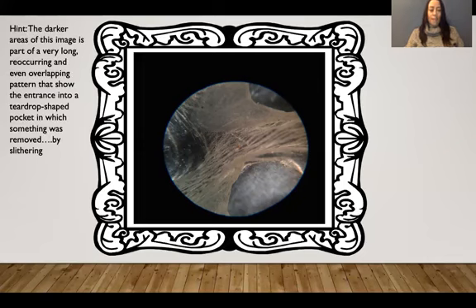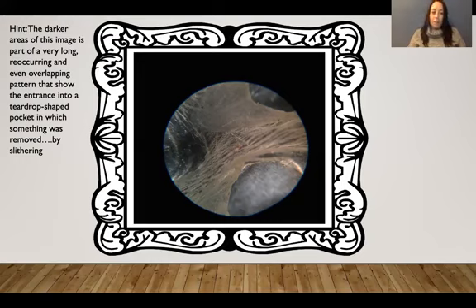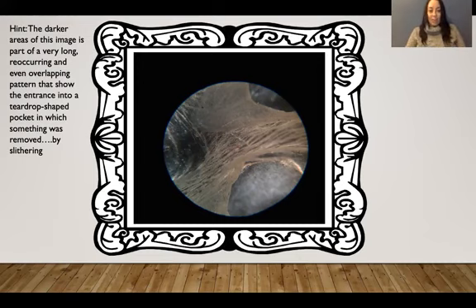Okay, and there is your hint. The darker areas of this image are part of a very long, reoccurring, and even overlapping pattern that shows the entrance into what is considered maybe an upside-down teardrop-shaped pocket, in which something was removed, possibly by slithering and movement. Hopefully that's what you can get from this and you can make a somewhat good guess. If you guys got it, I'm very happy.